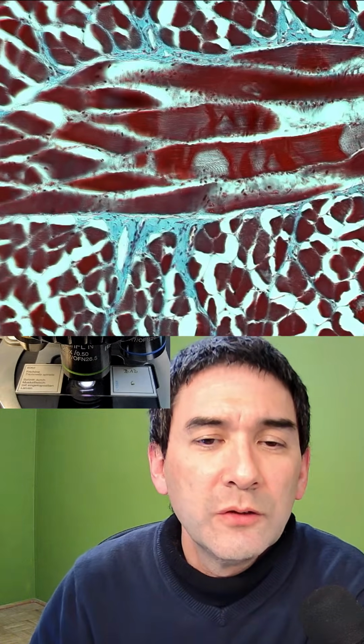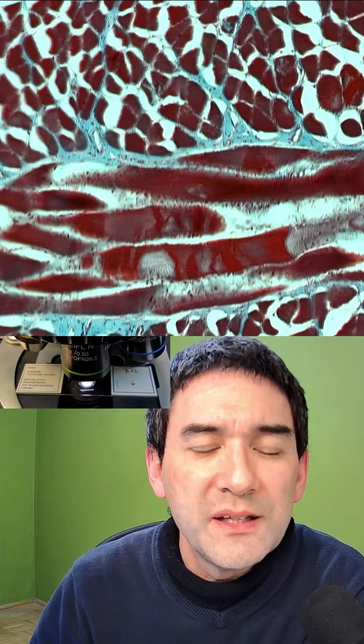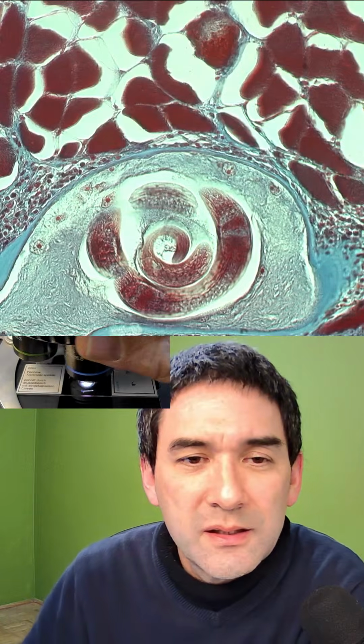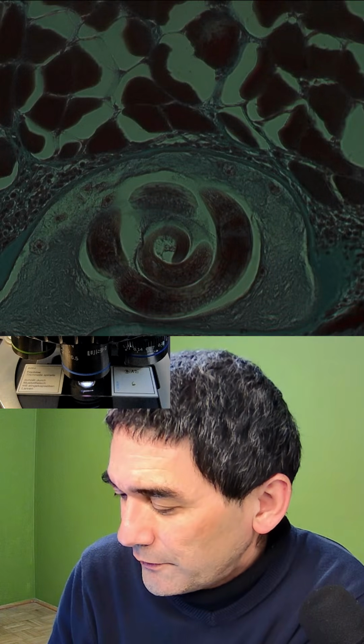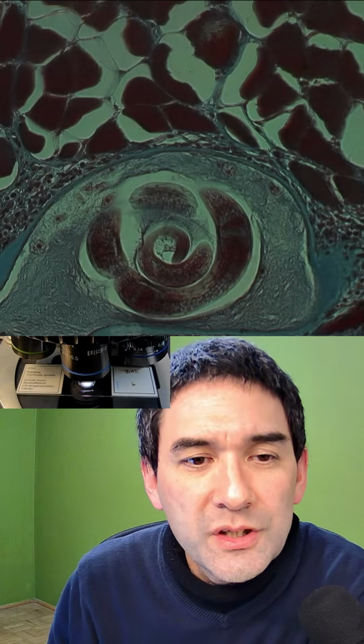So the scope view, and I need to get the whole thing in focus again. Okay, and that's muscle tissue, and we're now going to look for several of these nematode worms which are actually encapsulated in there, and here is already one of them. Eating this meat is a little bit... I'm going to turn off the automatic light adjustment here. So here we go.